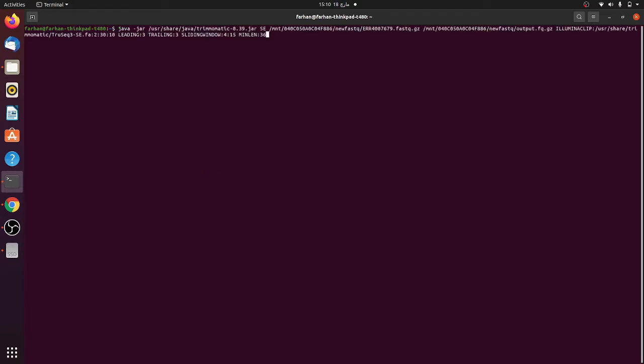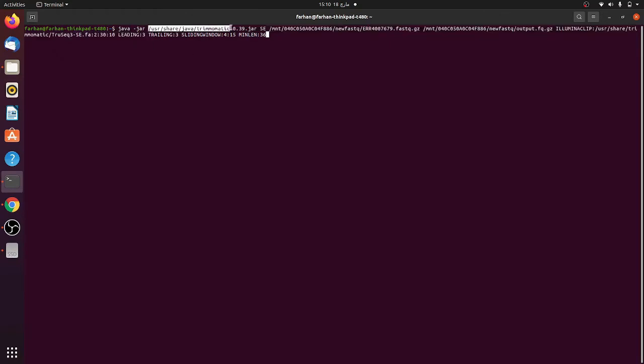Here you can see that Trimmomatic package is installed in user share java folder. This jar file is present. The data has single-end sequencing, so you need to have single-end sequencing command. First you need to write java, then minus jar, then the location of the Trimmomatic jar file, and then single-end sequencing.